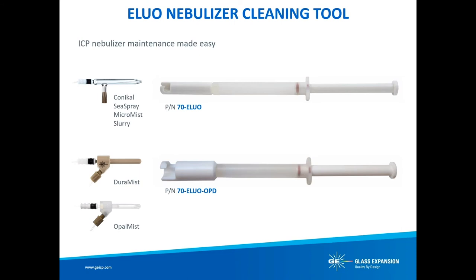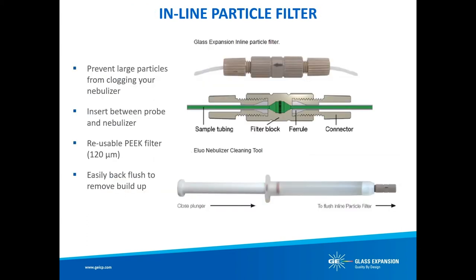The LUO nebulizer cleaning tool is designed to efficiently deliver a cleaning solution through the nebulizer capillary to dislodge particle buildup and thoroughly clean the nebulizer. Glass Expansion has two LUO designs: one for glass concentric nebulizers, which include the Sea Spray, Conical, Micromist, and Slurry, and a separate one for inert concentric nebulizers such as the Opal Mist and Demist. If blockages due to particulates are a frequent issue, consider adding the reusable inline filter. Particulates are not always from the samples themselves — dust particles from the lab environment and fibers from sample pre-filtering can also be sources. The Guardian inline particle filter provides a simple and effective way to eliminate these risks.